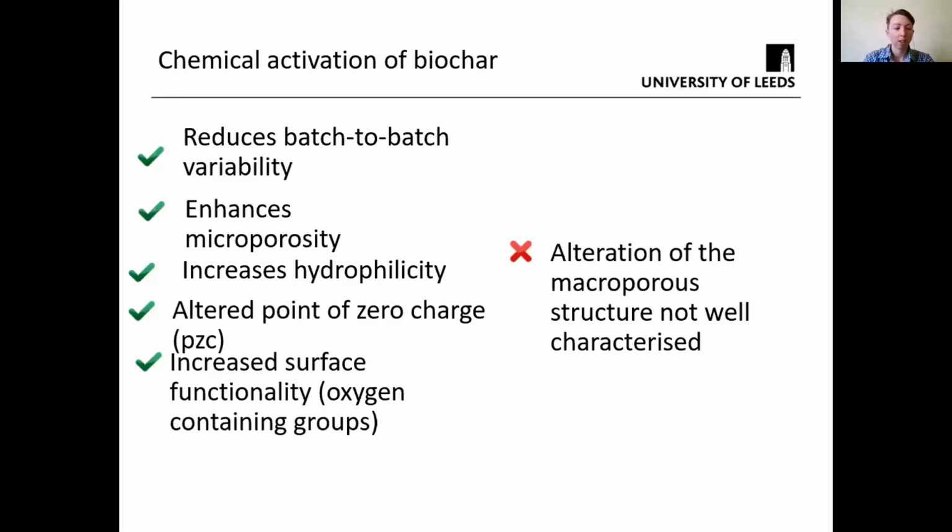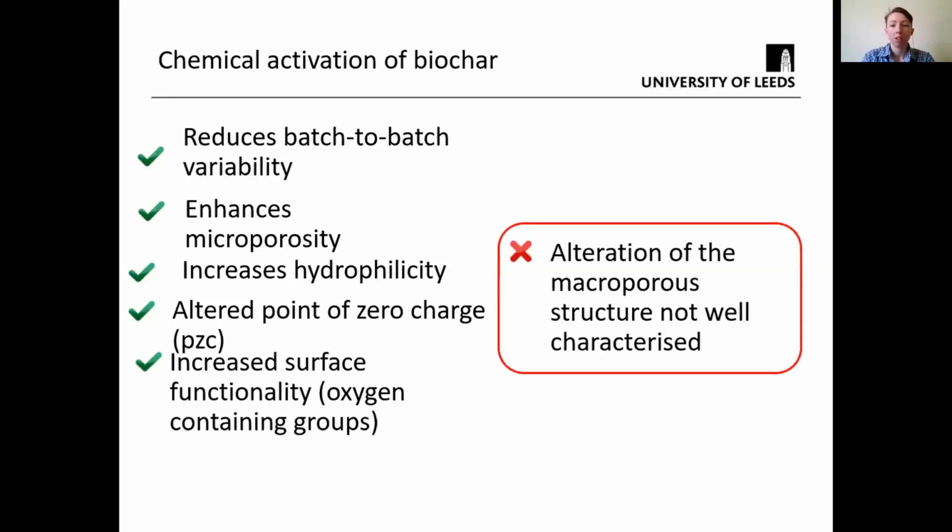So the effect of activation on micropore structure is quite well studied already, but in terms of the macropore structure, it's far less well studied.